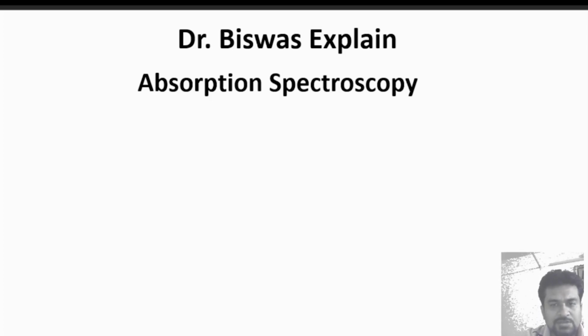So I will just discuss the basic things, and what you need to understand to very simply measure the absorption of your synthesized sample. I would like to discuss some theory before going deeper. Actually, you need to understand the Beer-Lambert law, which is very important here.